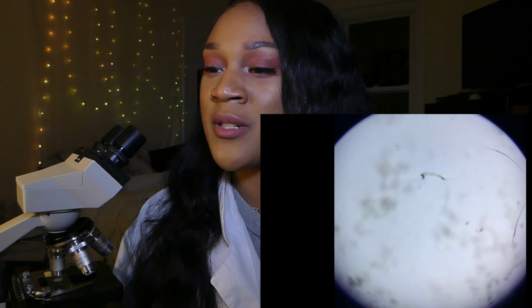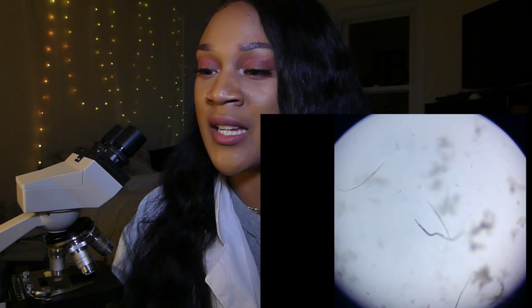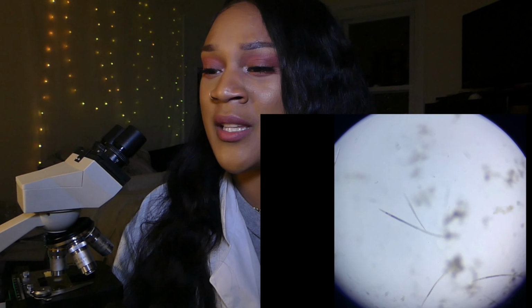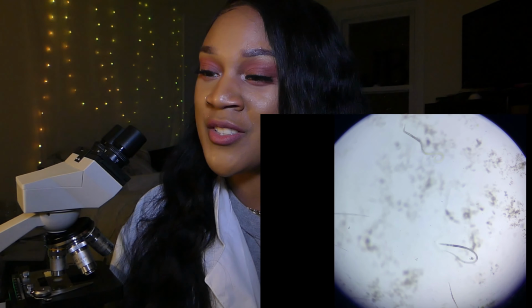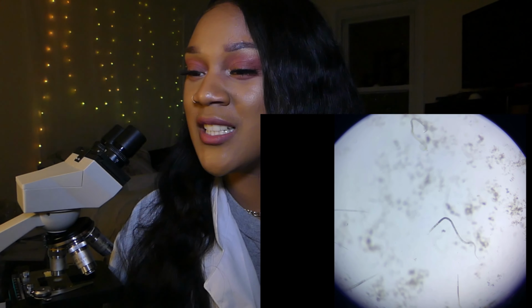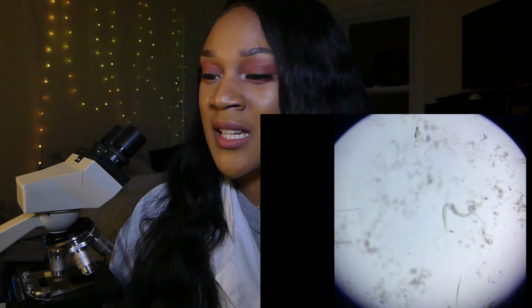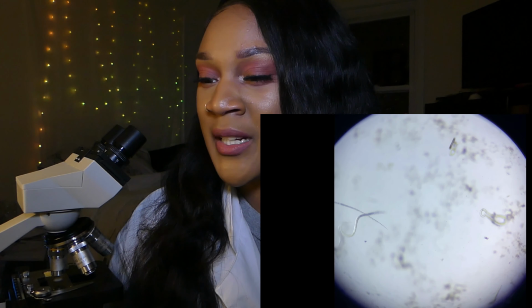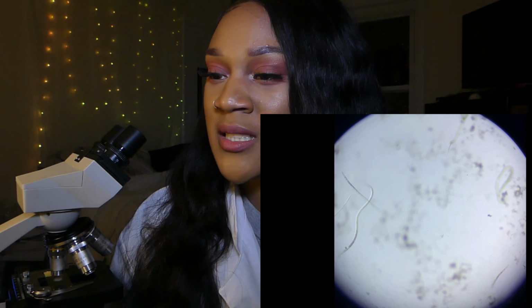This medium-sized one is trying to cling on. You can see the straight ones around as I move around the slide. These pieces here are apple pieces. That's what they eat. But look at all these straight vinegar eels. Those are dead vinegar eels. And this is what, 15 seconds in. These two are trying to cling on for dear life, but they know what their fate is. They know what time it is.